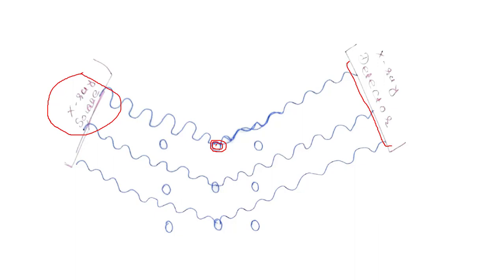And we all know that this angle is theta if diffraction takes place, and this angle will also be theta. So from that we are going to derive Bragg's law equation. For that we are considering this: we have layers of atoms.